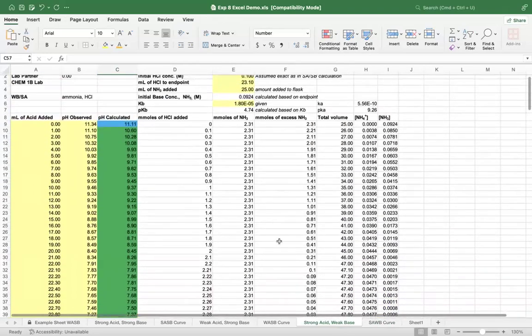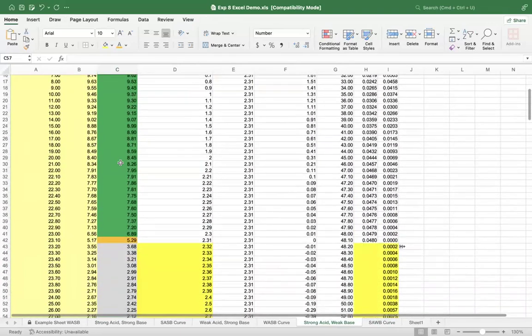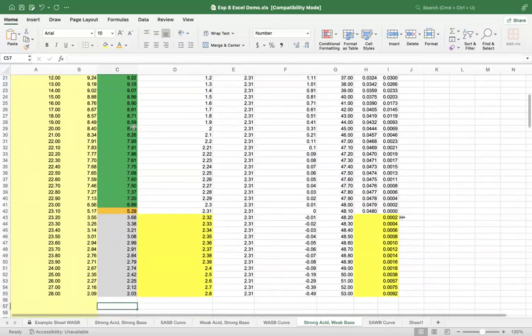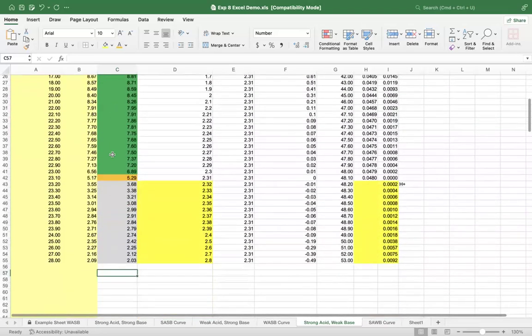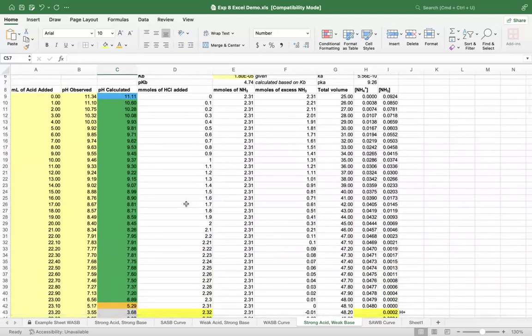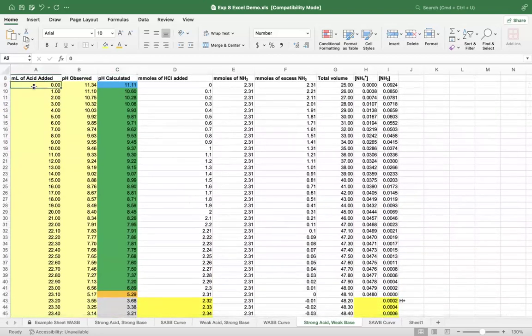All right. I hope I didn't go too fast for comprehension purposes. But it is a long one, so we do have to move a little quickly on it. I hope I wasn't too confusing with the steps down here. That's why I like to color code, just so that it keeps my mind from having to think extra hard. We really were only doing 4 calculation types and then just dragging everything down, but it helps to know where those spots are. Just to point out where those are, the first one's at 0 mils added, so that's why that color's there.